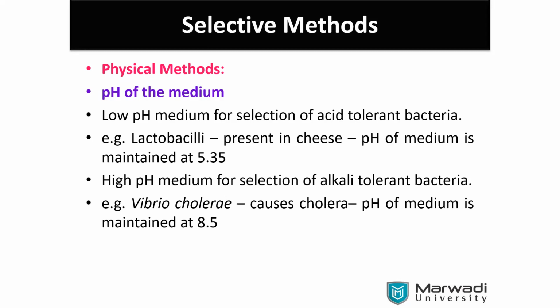Like if you are going for calcium carbonate, we need to go for the others while mixing it. We cannot go for natural sources. That part we have to learn. Right now we are not going to bother about it. I'm just giving a few examples that we can create acidophiles. We can go to basophiles, or alkalophilic organisms that can be grown over it. But it has its own limitations.